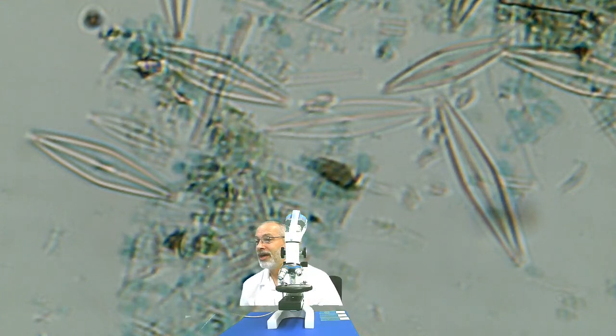So I'm going to give you some time. Again, this is diatoms, 100 times magnification. Draw what you see at this time. All right, and that's it.